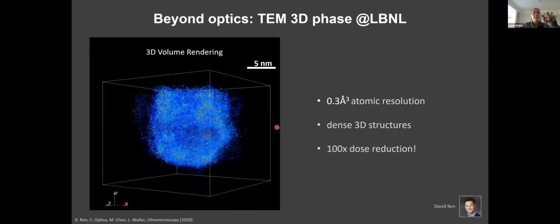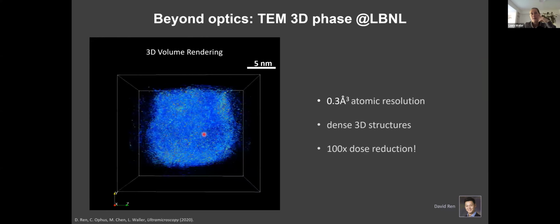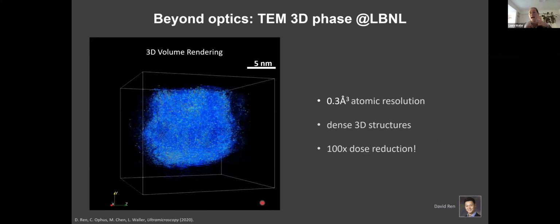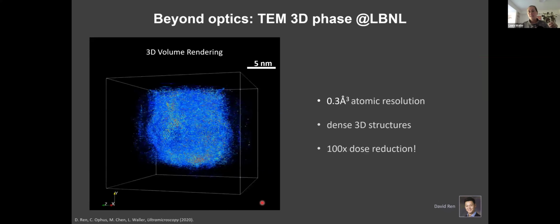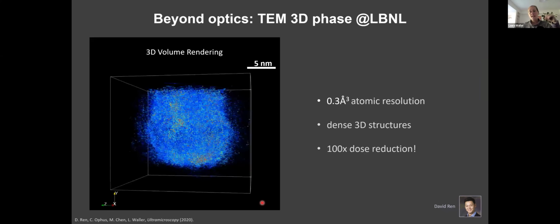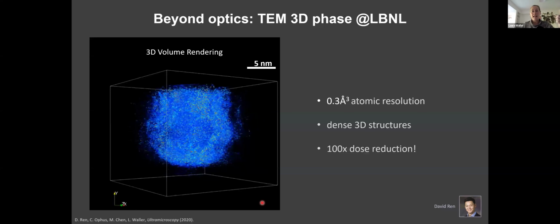So they want to look at individual atom resolution across a pretty thick amorphous sample with a lot of multiple scattering. Atoms are extremely highly scattering. It's like having a very high refractive index contrast. In fact, the refractive index map is analogous to the atomic potential when you go to electron tomography. And so they're actually very highly multiple scattering when you're just looking at atoms.